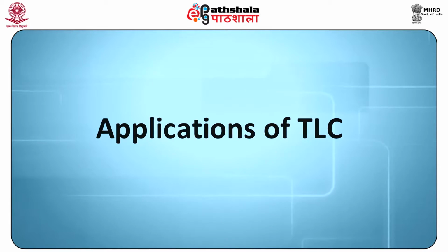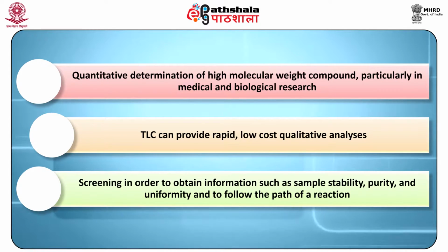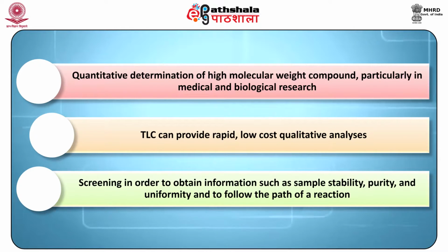Applications of TLC. Quantitative determination of high molecular weight compounds, particularly in medical and biological research. TLC can provide rapid, low-cost qualitative analysis and screening in order to obtain information such as sample stability, purity and uniformity, and to follow the path of a reaction.